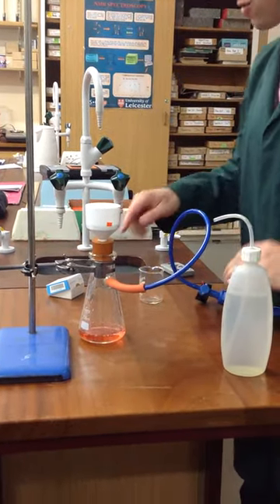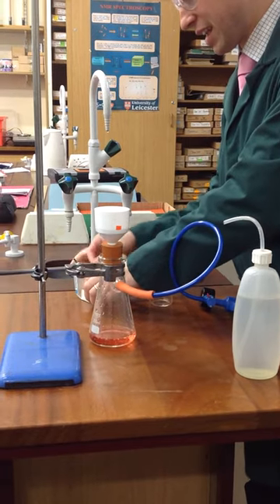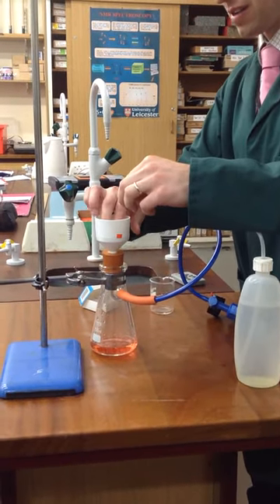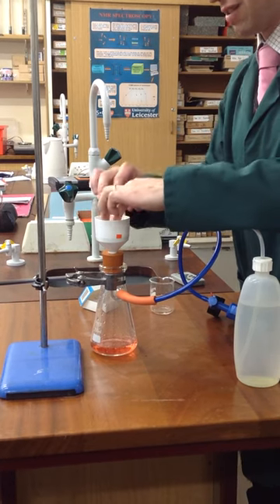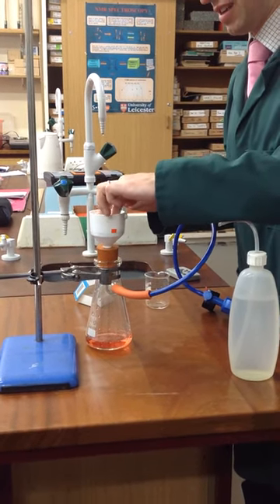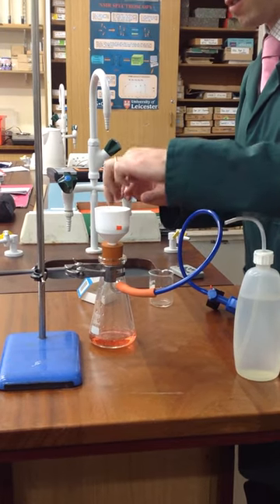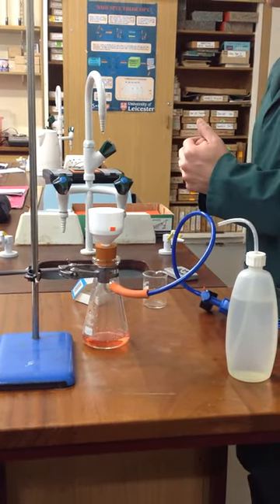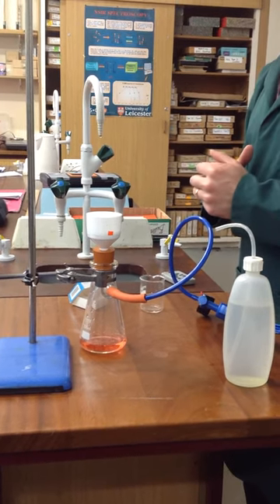And then what you're going to have to do is dry that solid. So what I find a nice technique is just to get a second filter paper, to pop that on top, and just press down lightly on your solid that you produce, and then you're ready to transfer this and you can just dry it probably in an oven overnight. Okay, so that's how you filter under reduced pressure.